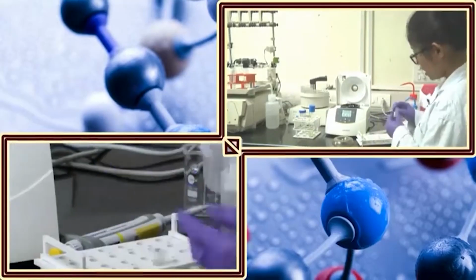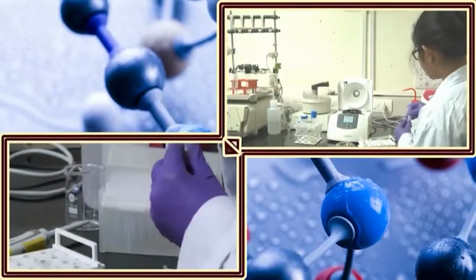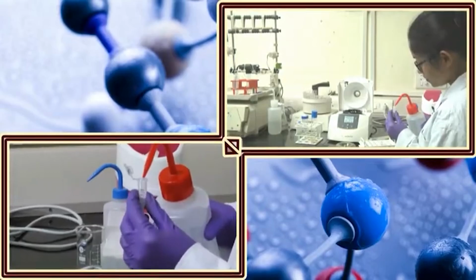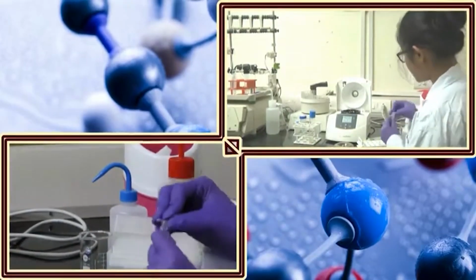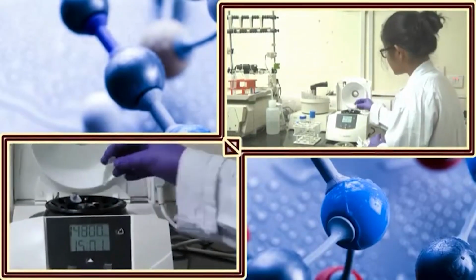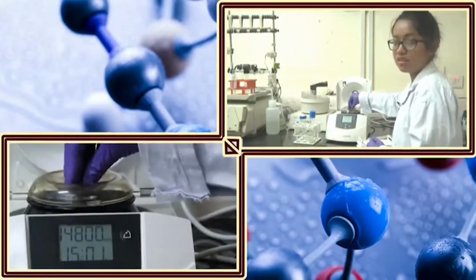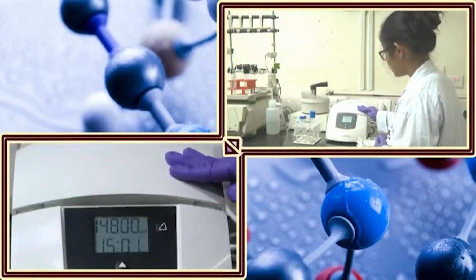Close the culture tube. Now as I have mentioned, you always need a balance in the centrifuge. So I am taking an equal volume of water in the other tube, which is written as balance. And now I will keep the balance, and then directly opposite of the balance I will put the culture tube. Now always remember to put the lid on the rotor, otherwise it will again show an error. Close the centrifuge.